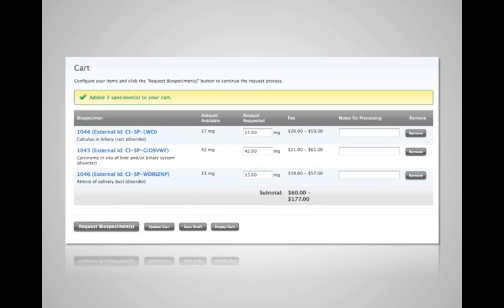You're on your way to cost recovery by finally being able to let people see your inventory. Next, you can set a single price or a range of prices based on various tissue parameters.